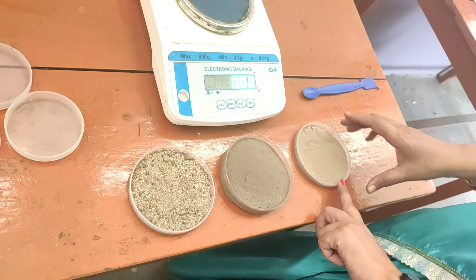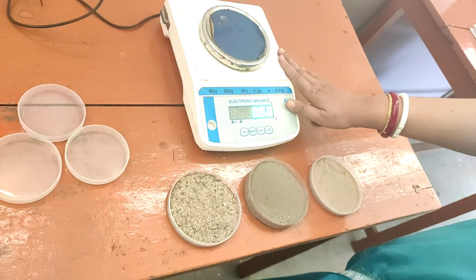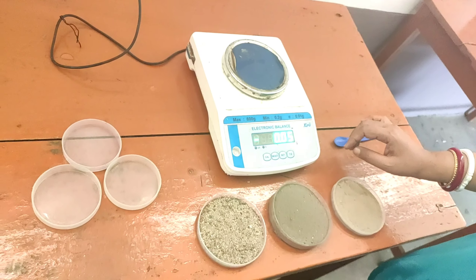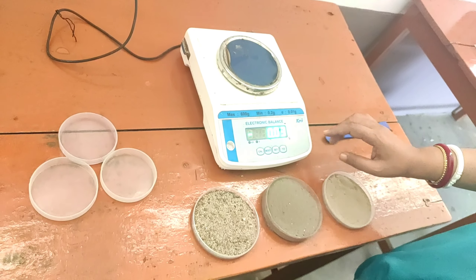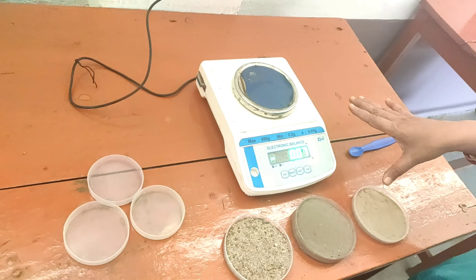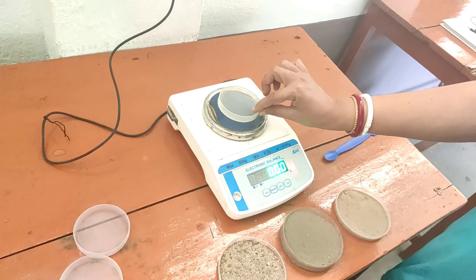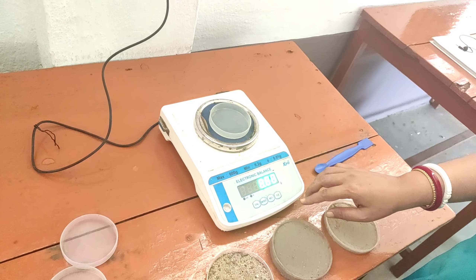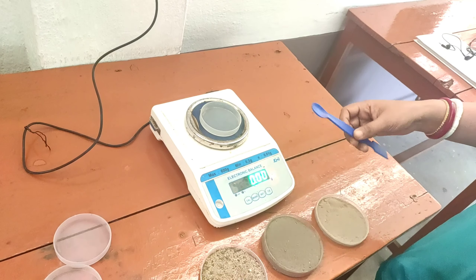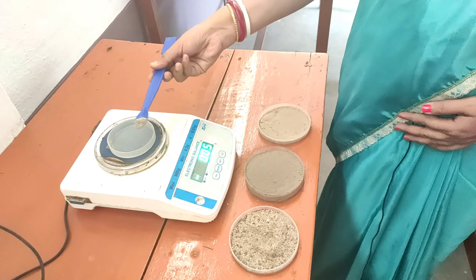This is your electronic balance in which we are going to measure the different soil samples — five grams each. First we have to set it to zero, then put a petri dish, set it to zero again, and with the help of this spatula we will collect five grams of soil.